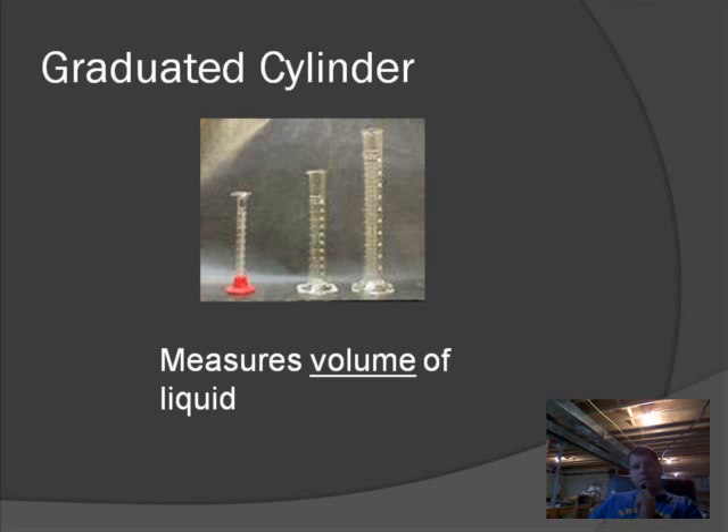The first piece of lab equipment I would like to introduce is the graduated cylinder. This equipment's job is to measure the volume of liquids, and it does an excellent job. It's designed to be very accurate. If you notice on the side, there are lines, a scale, and numbers. Later on we'll be teaching you how to read a graduated cylinder.